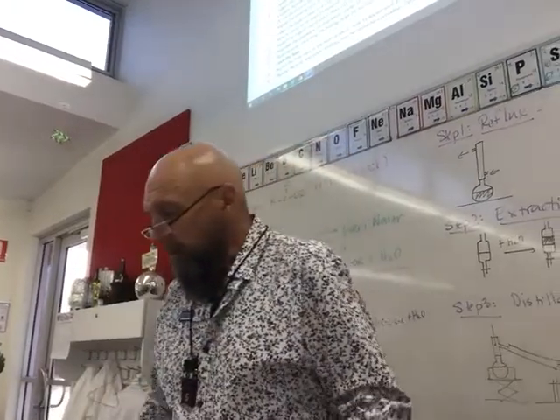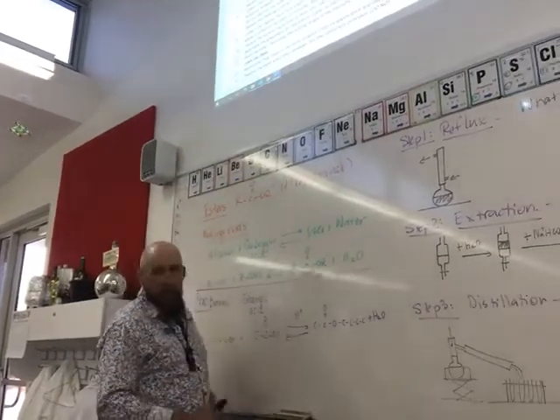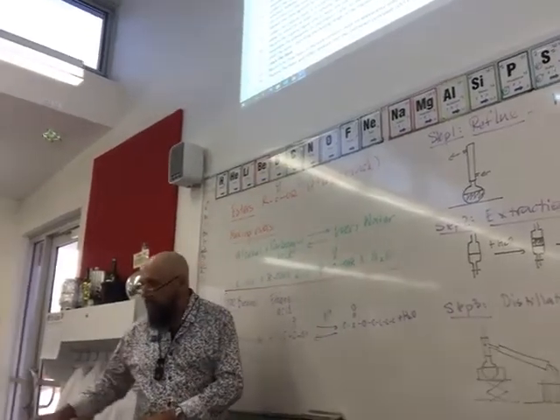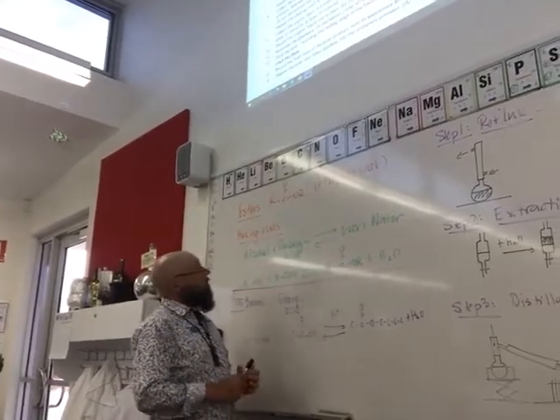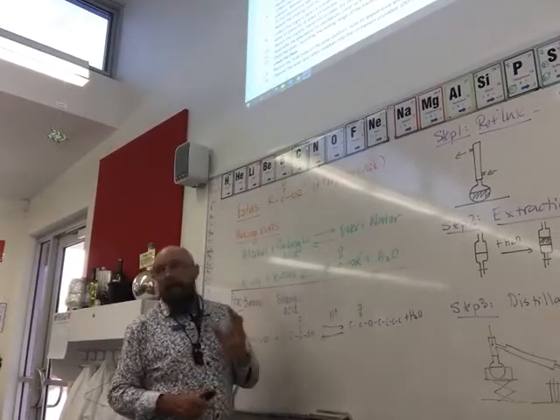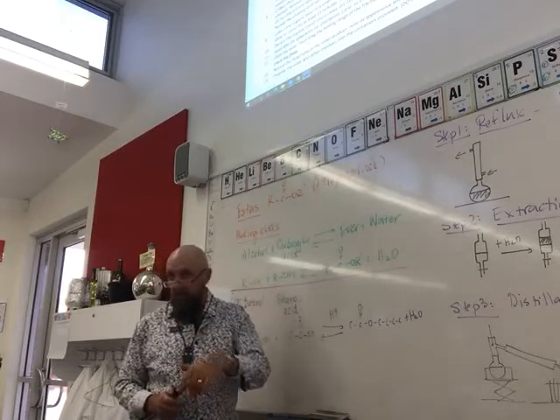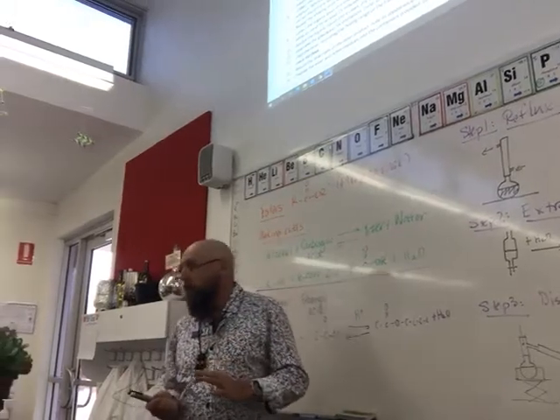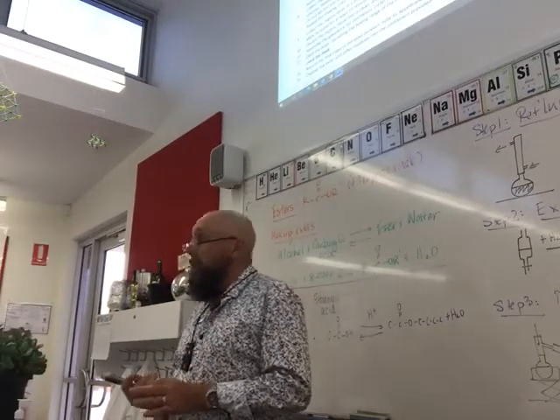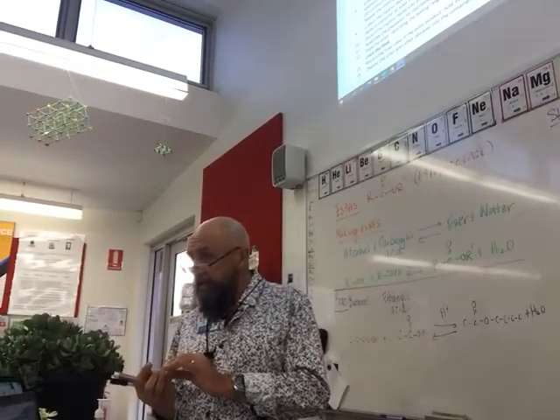Okay. So, what is our practical about? Well, I've got it laid out on the board here behind us, as well as sitting up there, if you've got the file open. What we're going to do is make an ester. That's the function of the practical next week. That's the purpose behind it. Now, we haven't talked a lot about esters. Esters are typically chemicals that smell sweet, and they also have a sweet taste.